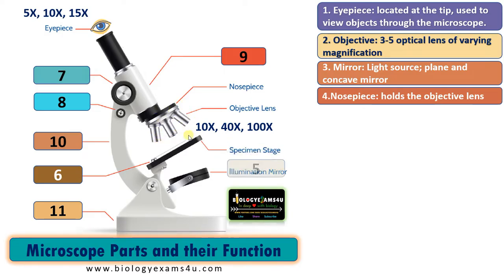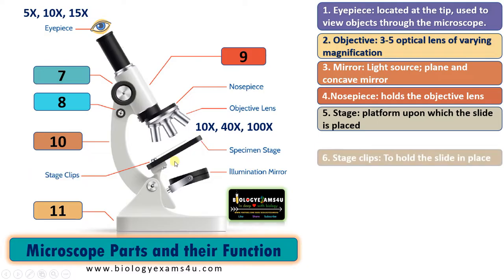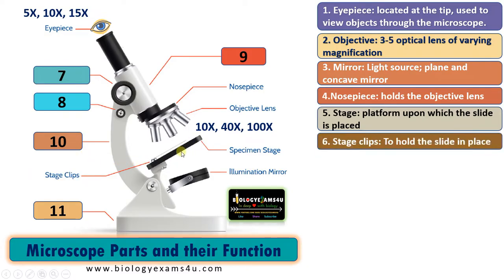The next part is the specimen stage. It is a platform upon which we place the slide with our specimen. The next one is the stage clip. The stage clip holds the slide in place — as you see, we can tilt the slide, and the stage clip helps to keep it intact without changing the position.